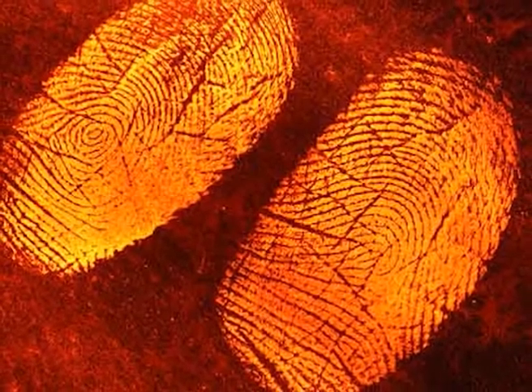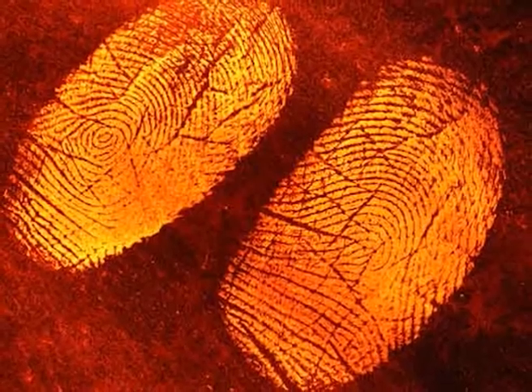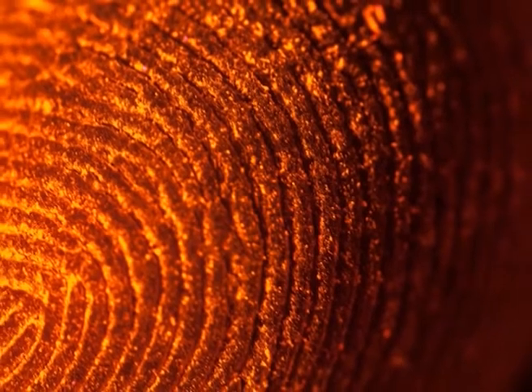Some printing inks fluoresce under these conditions and therefore interfere with fingerprint detection. However, the optical brighteners present in paper do not hinder the visualization of prints. Fluorescent fingerprints visualized by the DFO method normally reveal more detail and clarity than those shown by the ninhydrin developed imprints.